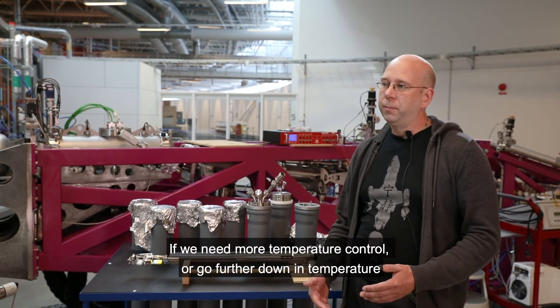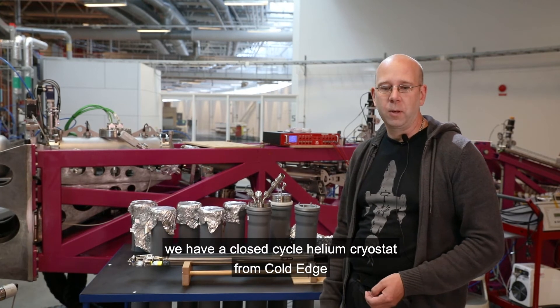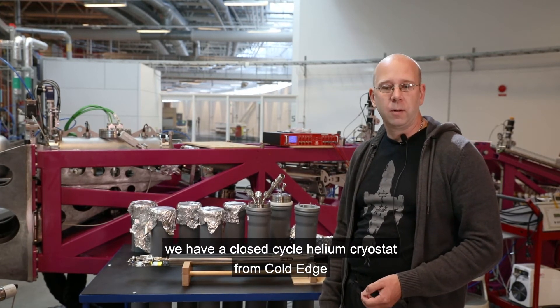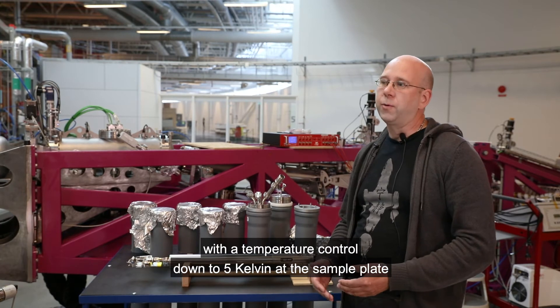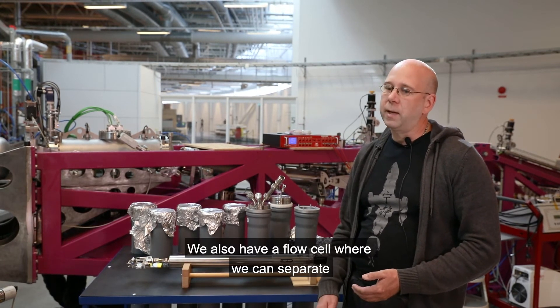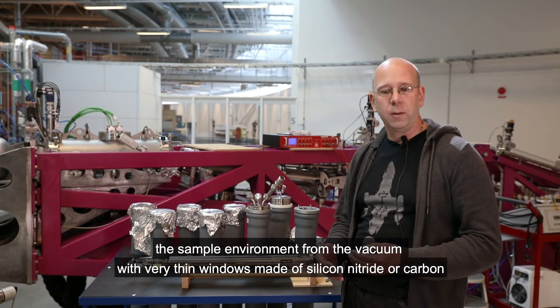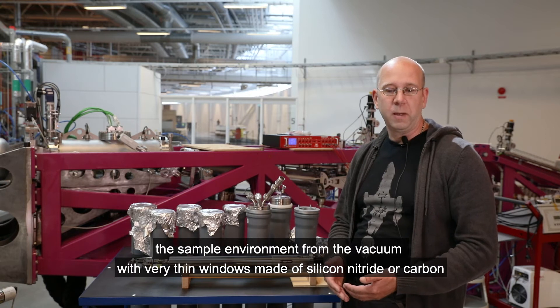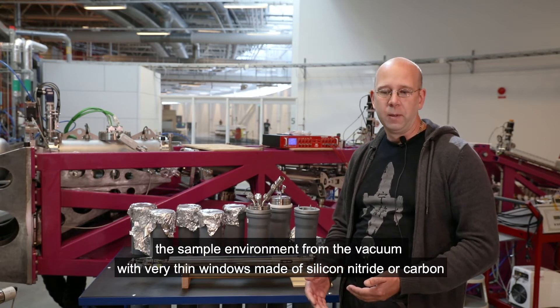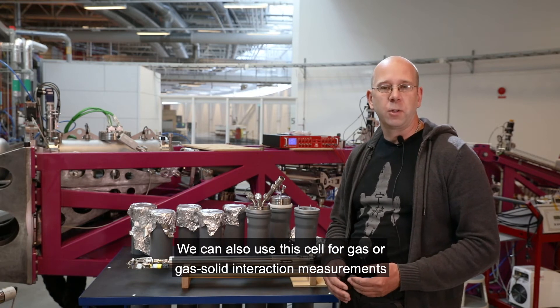If we need more temperature control or to go further down in temperature, we have a closed-cycle helium cryostat from ColdEdge with temperature control down to 5 Kelvin at the sample plate. We also have a flow cell where we can separate the sample environment from the vacuum with very thin windows made of silicon nitride or carbon. We can also use this cell for gas or gas-solid interaction measurements.